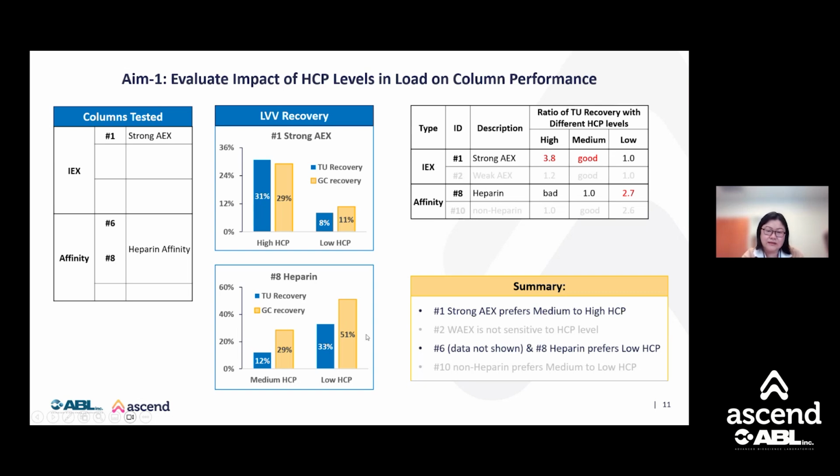Regarding number 6 and number 8, the heparin affinity resins, they show an opposite trend. Both of them have very low recovery in the high and medium HCP. However, when we remove HCP using a mixed mode resin, the LVV recovery improves significantly.